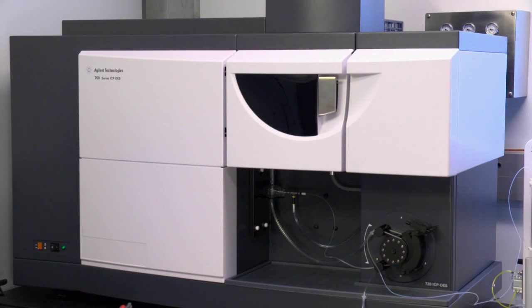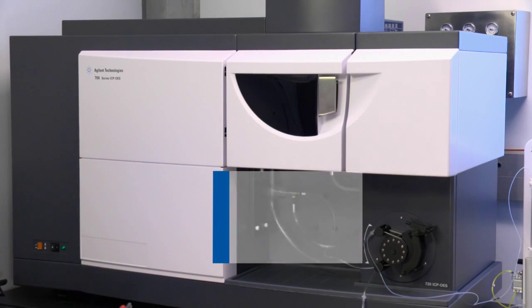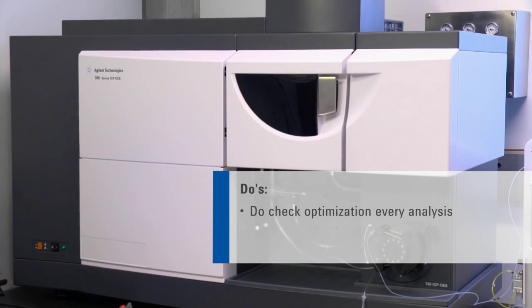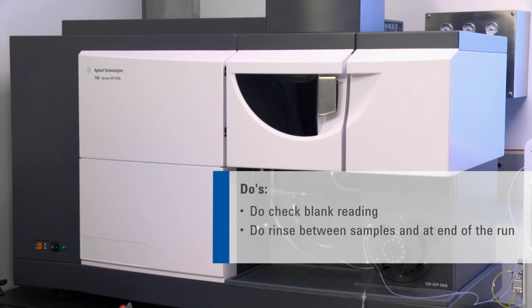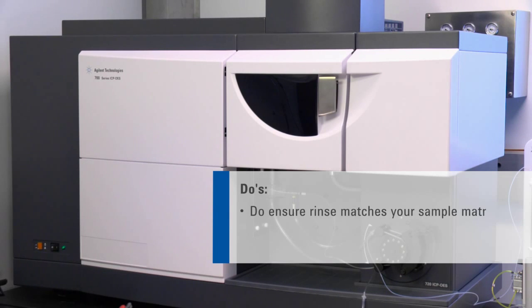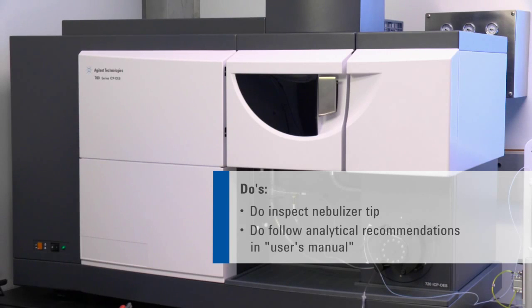There are some general do's and don'ts in using an ICP-OES. For example, verify performance before analysis by checking nebulizer uptake, parasitic pump tubing, and the blank reading to ensure there is no carryover from a previous analysis. Be sure to rinse between samples and at the end of the run. The rinse solution should match the sample matrix. Clean the torch and nebulizer regularly and inspect the condition of the nebulizer tip. Finally, follow analytical recommendations in your user's manual.